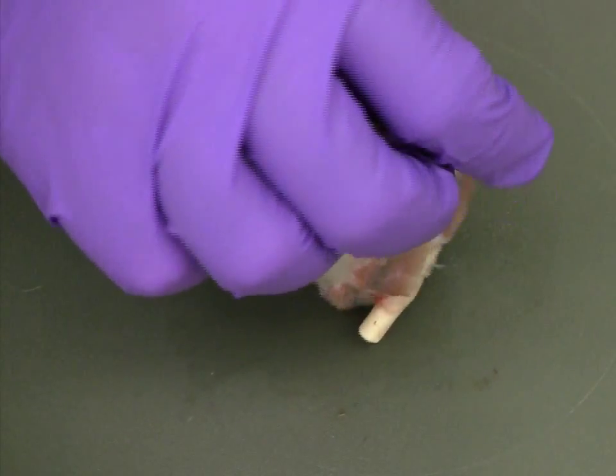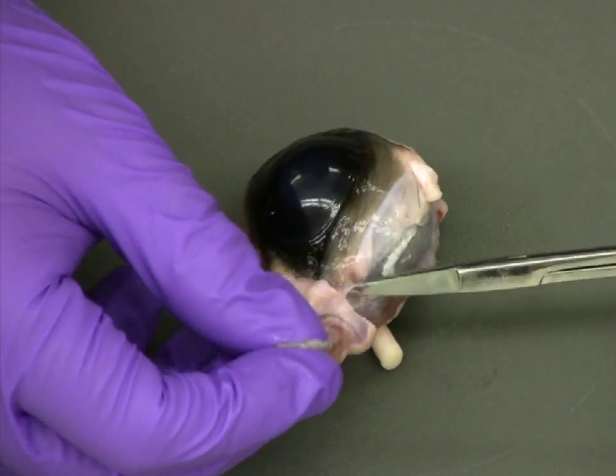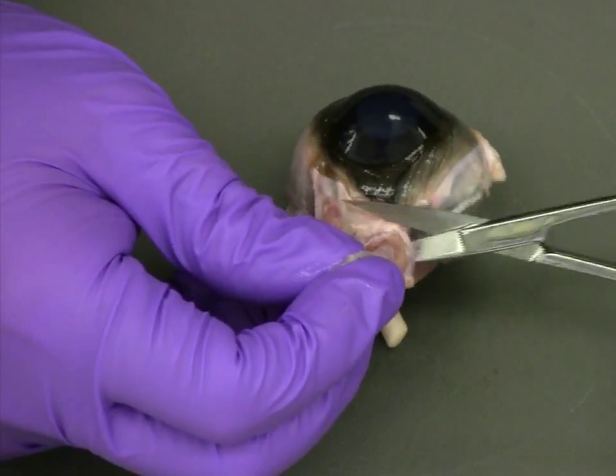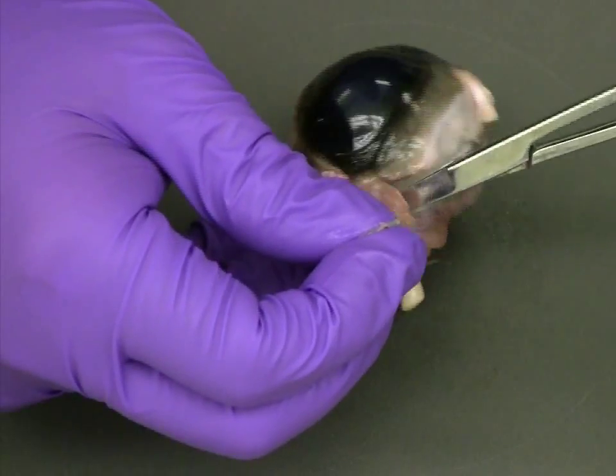Using dissection scissors, trim away all of the exterior fat and muscle from around the sclera before beginning dissection. Since removing the tissue can take several minutes, we're going to speed the process up here to save time.